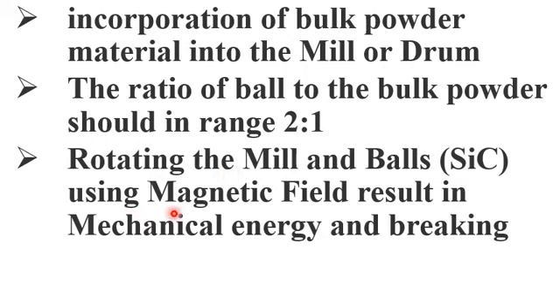Students, please note that at advanced level, magnetic field is used in ball milling apparatuses. That magnetic field results in mechanical energy and breakage of the bulk material. So that is an advanced study.